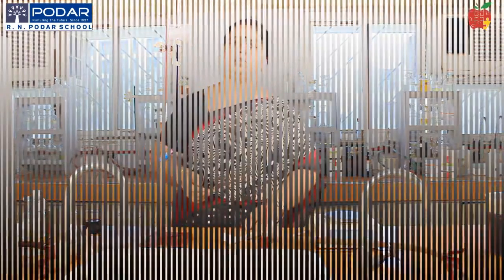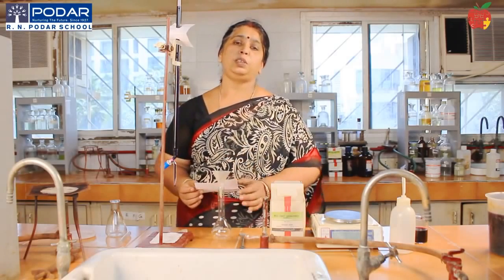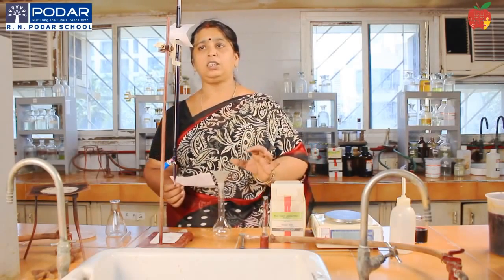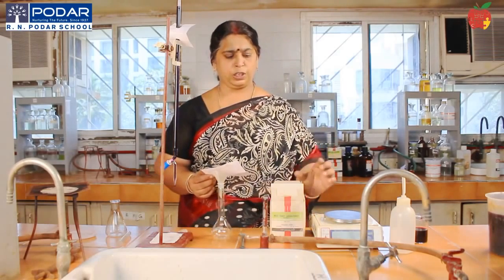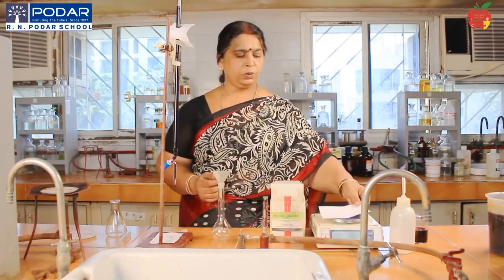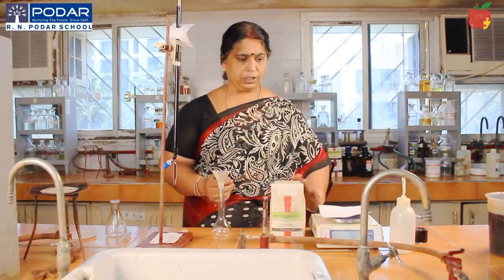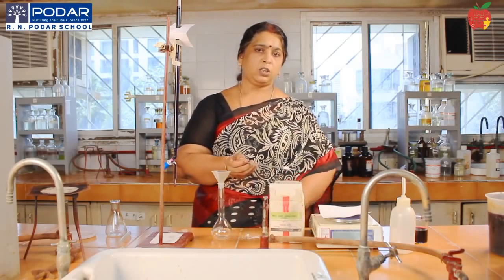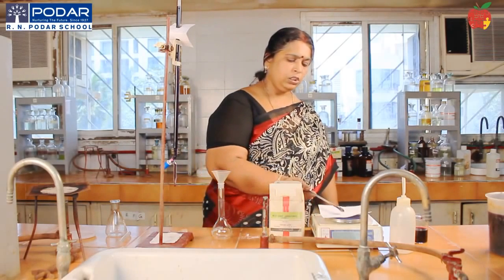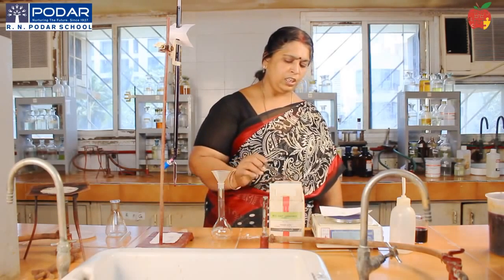Now I am just going to demonstrate the preparation of standard oxalic acid, and the titration versus the KMnO4. So just take the weight of oxalic acid, use a paper, put it on the balance, find out the weight of the paper, tare it, meaning make it zero with the paper. How much do you have to take? You have to take 0.63 grams of oxalic acid. That calculation you might have done in your paper, right? So just add 0.63. You can see the balance reading. Accordingly, remove or add what is required.